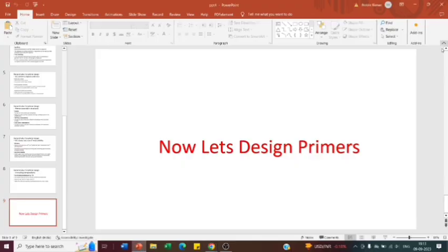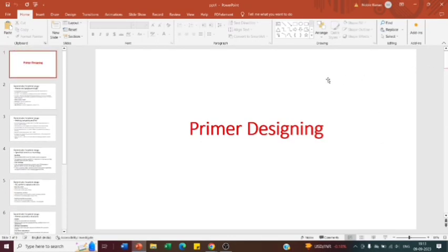We will go for primer designing. So when we need to do PCR, primer designing is the important problem while doing a PCR, because we usually get primers maybe from publications. Sometimes that publication primer may not be working for us. Mostly we need to design our primer, and we need to synthesize it by giving it to DNA synthesizers, and they will synthesize and give.